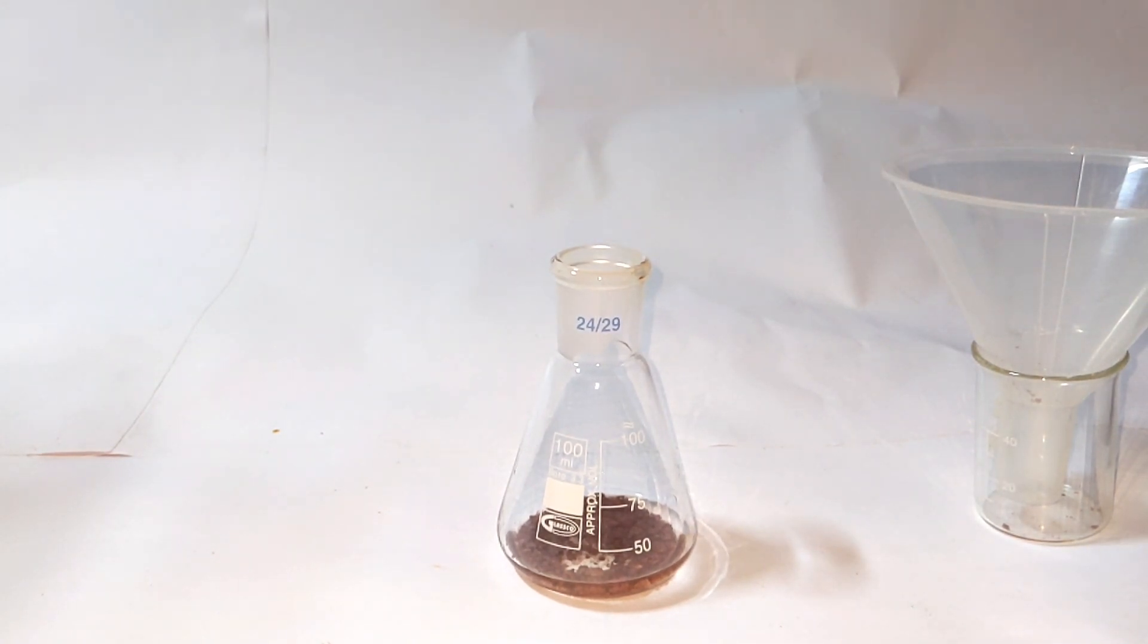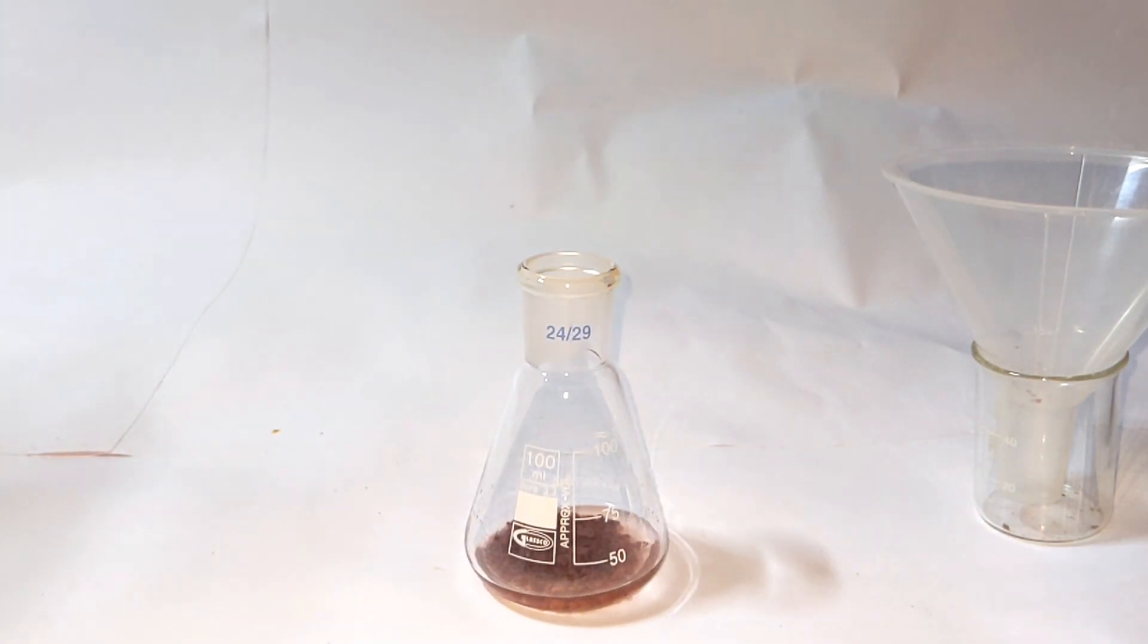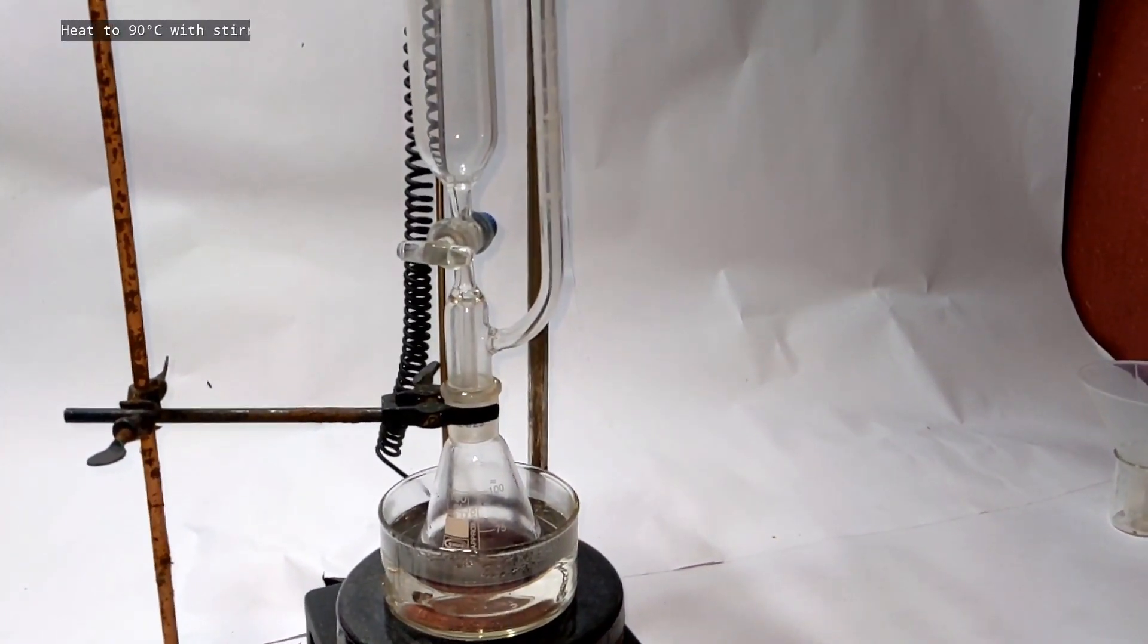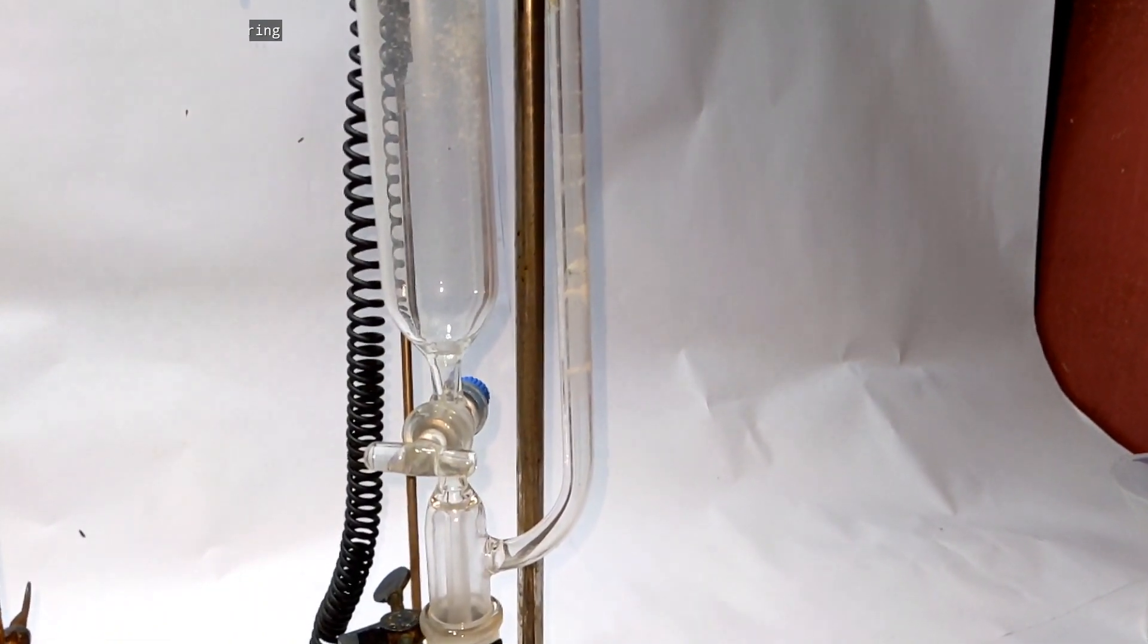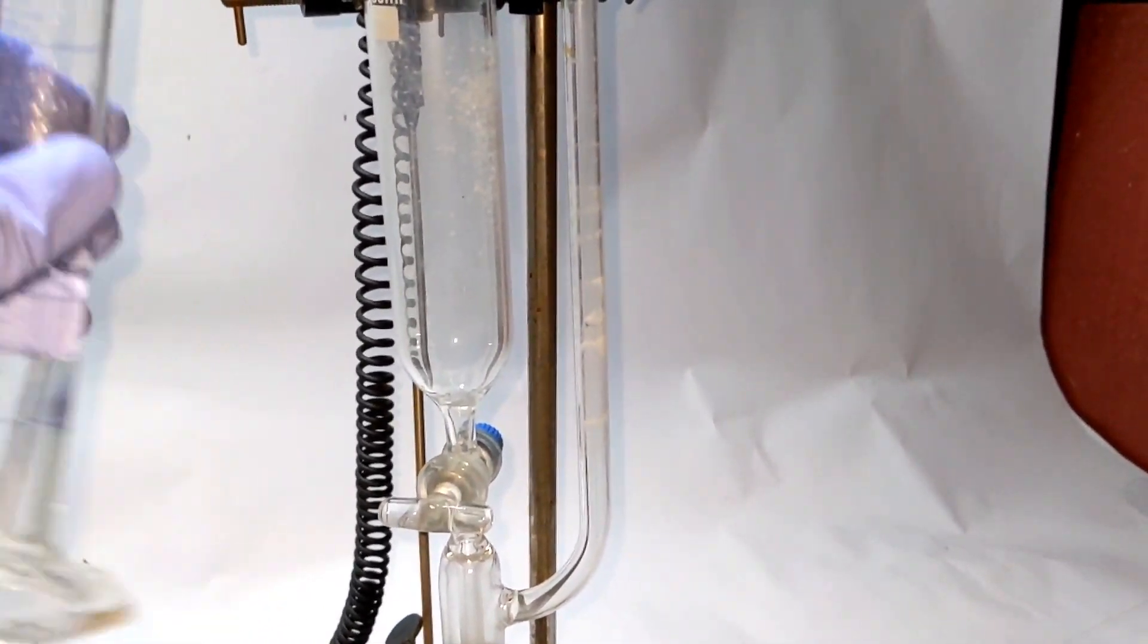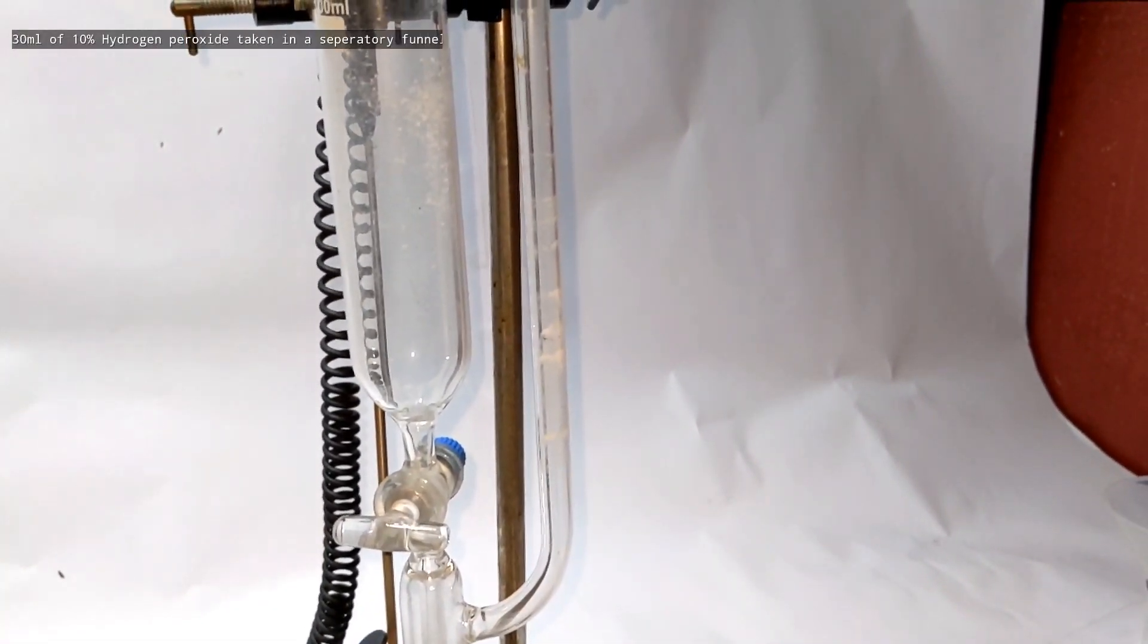The mixture was shaken well and it was placed in a setup like this. A pressure equalizing funnel was connected on top of the flask and the flask was placed in a water bath which was heated to 90 degrees celsius with stirring.